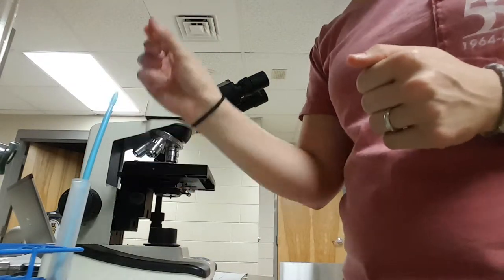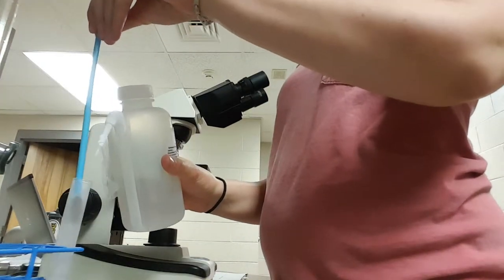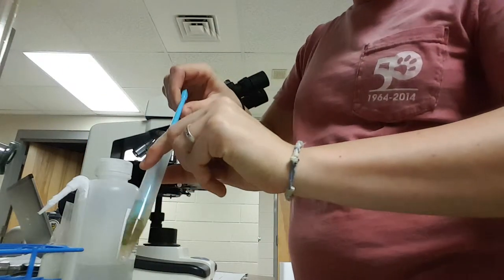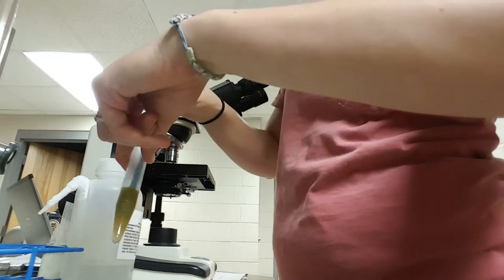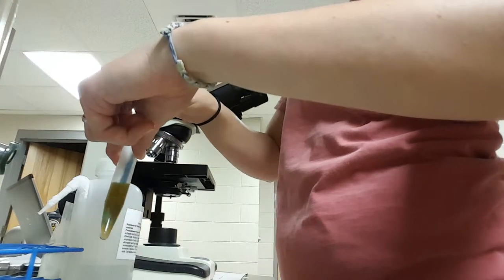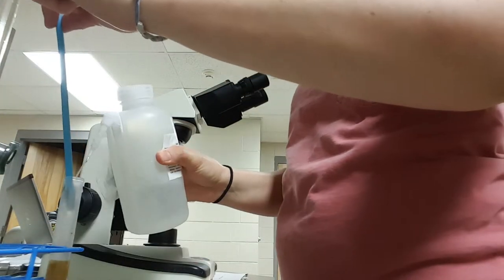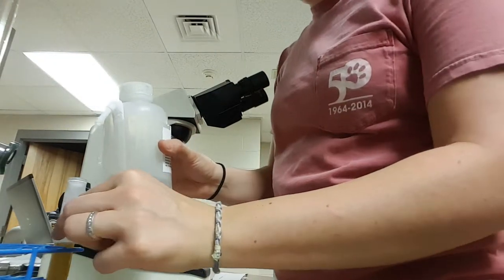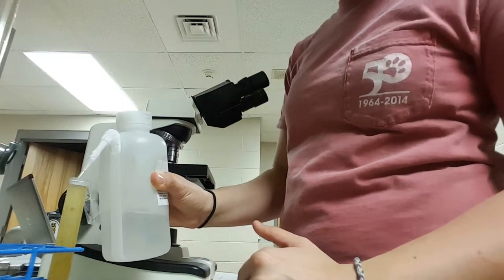I have my fecosol fecal solution here and I'm just going to apply a small amount. I'm going to start mixing to try to get most of that fecal matter off the fecal stick into the test tube. That's pretty good, so I'm going to take that away and fill my tube until it forms a meniscus on top.